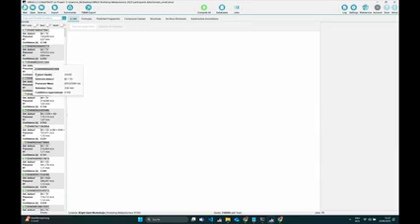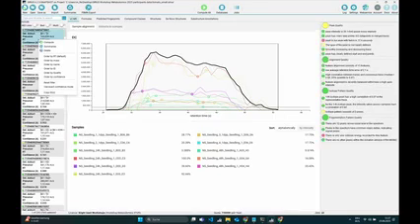And maybe if you don't have time to look at everything that you have, and you don't want to spend time on looking at features where you can't get good annotations, you might want to look only at the features which have a high confidence score. And to quickly show them, you can now right-click on this feature list.